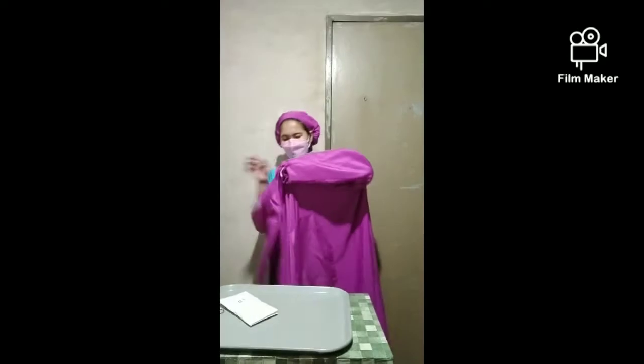Work hands and arms into the gown and the seams between gown and top. Make sure that you do not touch the outer part of the gown because it will lessen the sterility. Then, turn your back for assistance in securing the gown at the neck and back. Make sure that the assistant does not touch any object to maintain sterility.